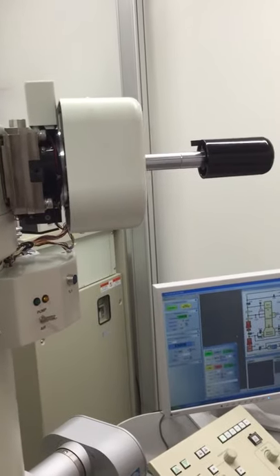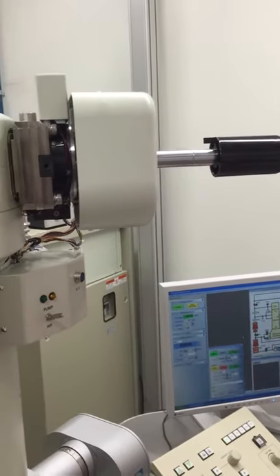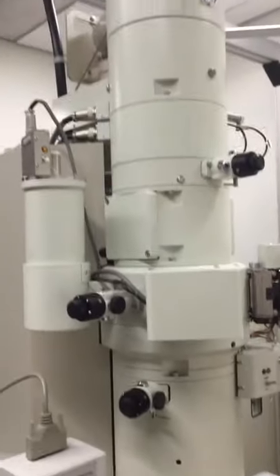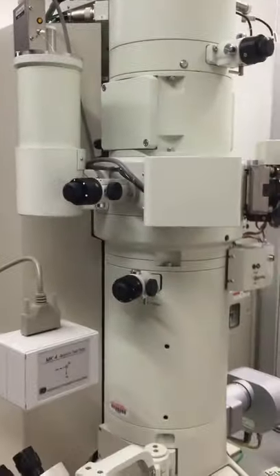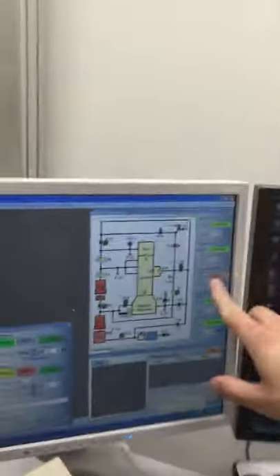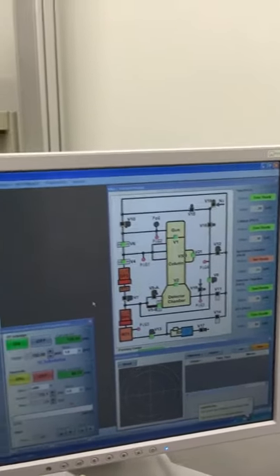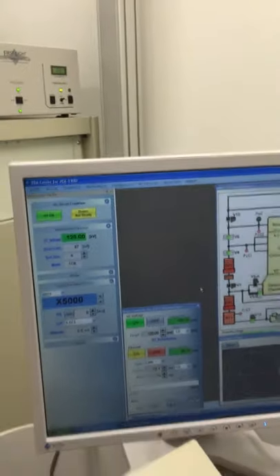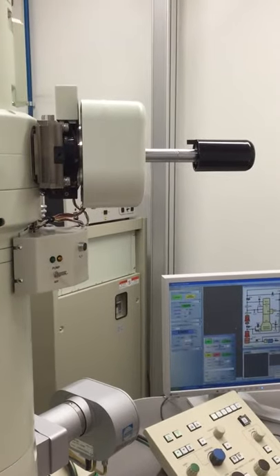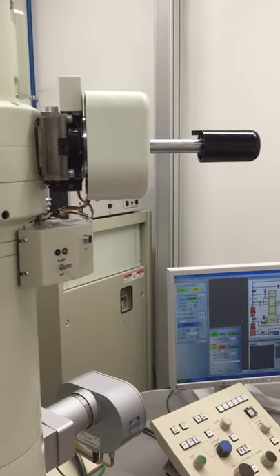You can hear the valves opening. On the other side, we can see if the specimen chamber is not ready — all the other ones are vacuum-capable. We can see when the specimen is ready to be fully inserted.